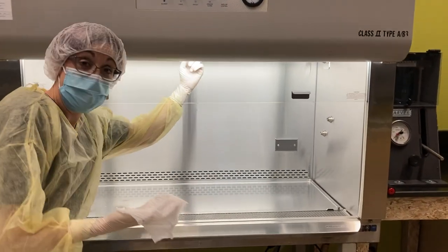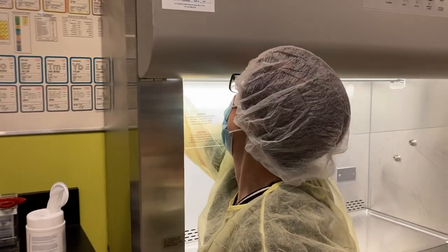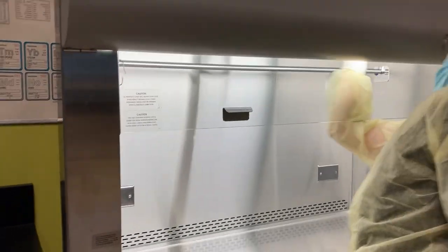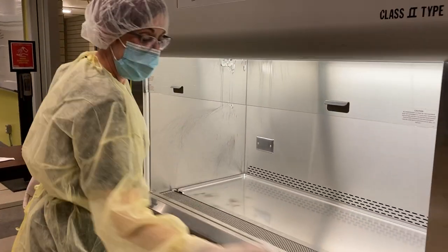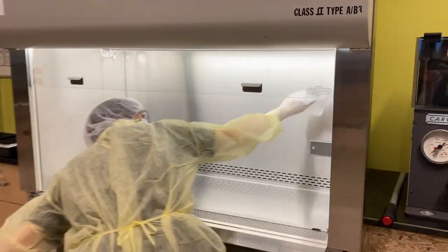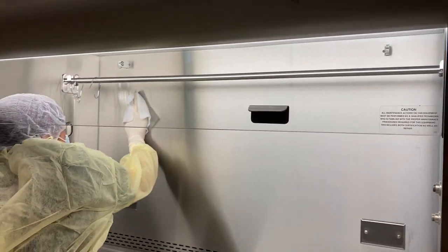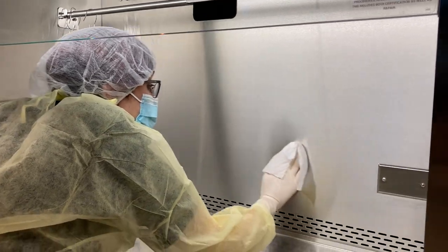And you're going to start with the ceiling of your primary engineering control. So you're going to start at the back and doing a side-to-side motion, work back to front. Grab a new wipe for each surface, and we're going to clean the back panel. Again, side to side, slightly overlapping, working from top to bottom.